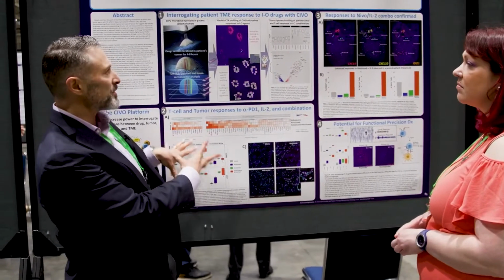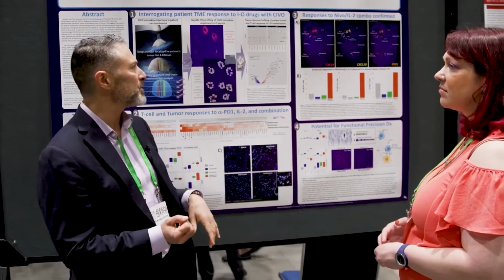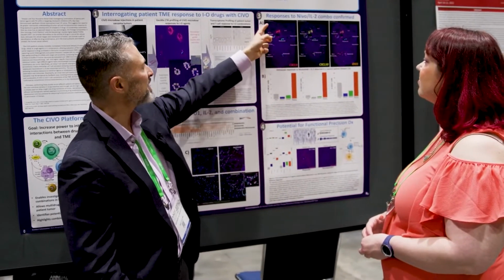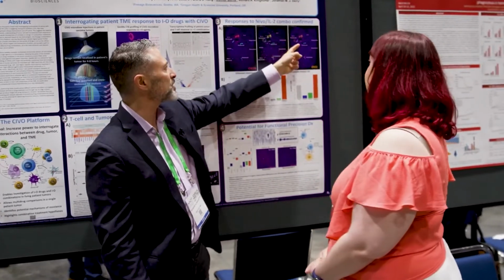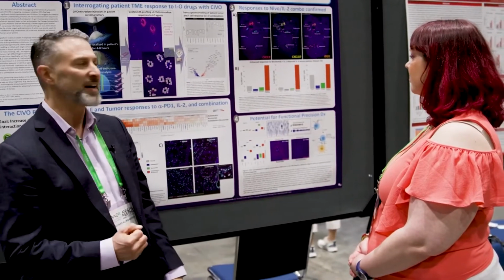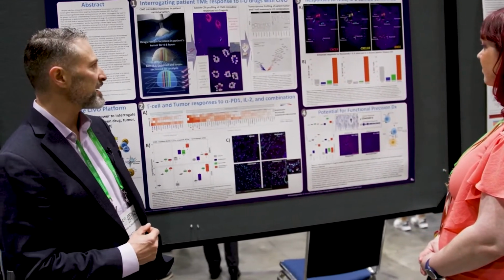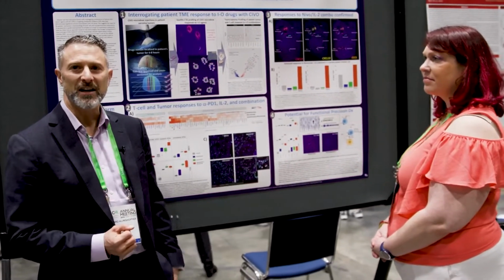And again, similar to what we saw with DSP here, we could see elevation of pro-immune signals, like elevation of the chemokines CXCL9 and CXCL10 only in the region that saw the drug combination. But interestingly, again, we see the tumor trying to reach homeostasis by elevating the feedback loop, an immune suppressive event, IDO1. And you can see that when we quantify these, it's very synergistic when we look at the combination versus the single agents.